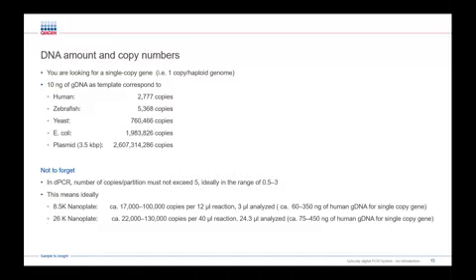If you decided to always use 10 nanogram of DNA as template, this would correspond to copy numbers ranging from roughly 3,000 to 2.6 billion copies per reaction. The latter one would result in hopeless overloading of the QIAcuity nanoplates. You will see and learn during this presentation that in dPCR, at least a few partitions must be empty, which means negative, in order to apply the calculations for template concentration.